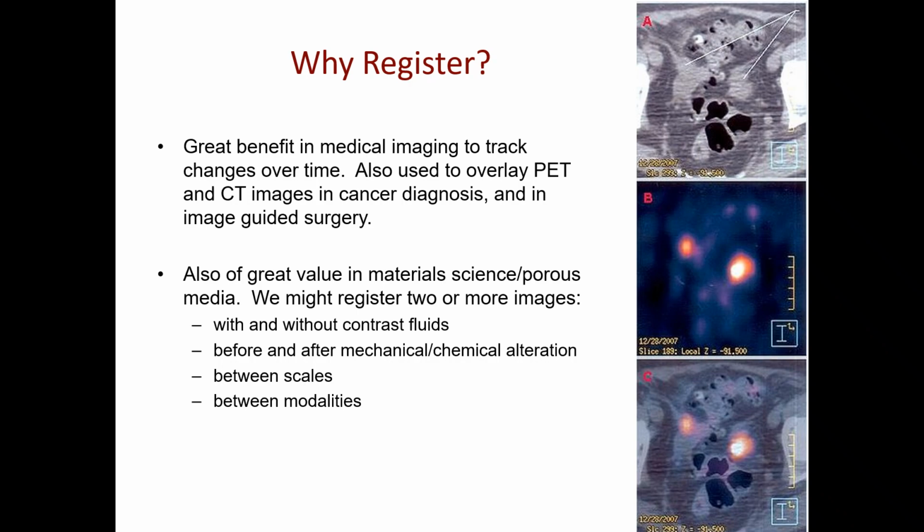Let's say that I have a sandstone core. I could do an SEM of the top or somewhere in the middle and try to find it in my large image through cross sections. Basically I will do that by attempting to register. They just have to be of similar sizes or on the same physical scale.